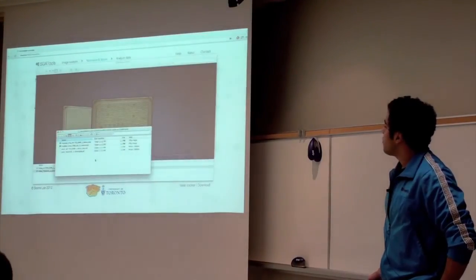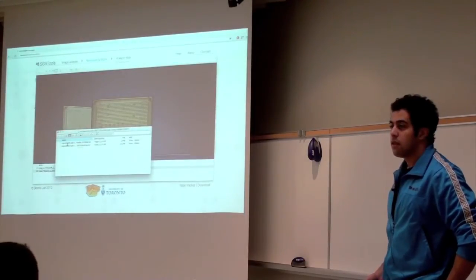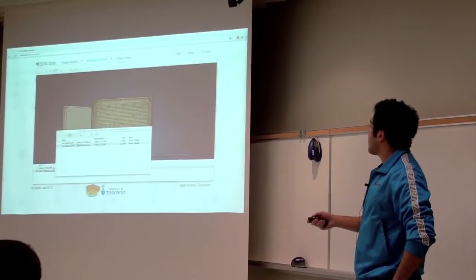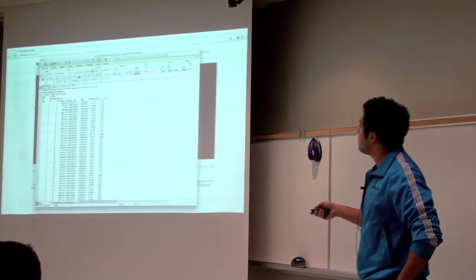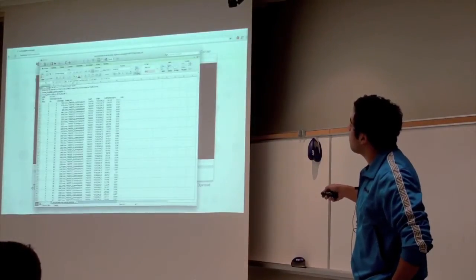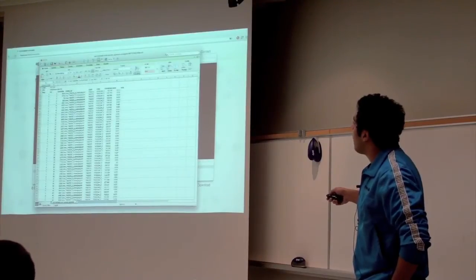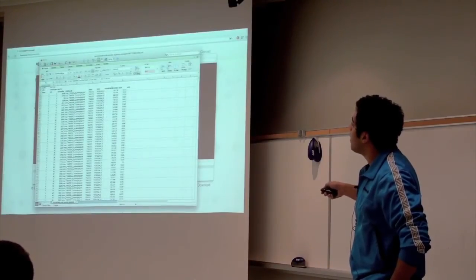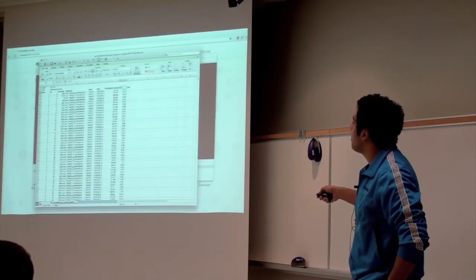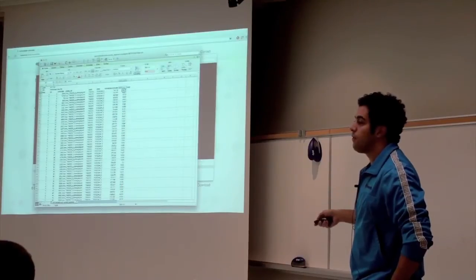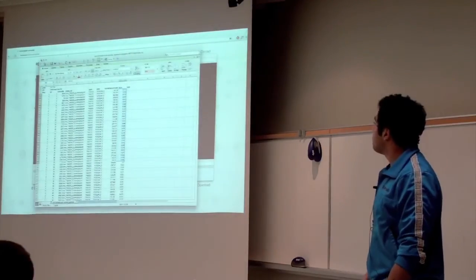So if you take a look at the data, again, it's an Excel spreadsheet. You get back a detailed file. It's row, column. You have the ORFs that you supplemented. You have a normalized colony size over here. The initial colony size is over here. And then you also have a score, which you can see over here. So from here on, you can just take these scores and analyze them. And it becomes super easy to use.